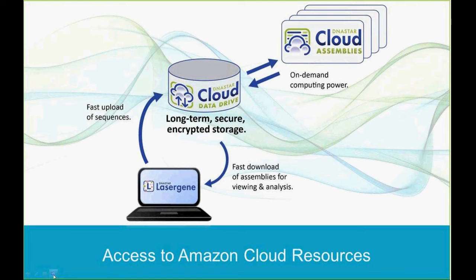One of the focuses for DNASTAR the past couple years has been accuracy. For any of these NGS workflows, whether it's ChIP-Seq or RNA-Seq or targeted resequencing, you want to be assured that the assembly algorithm is the most accurate that you can possibly use. We've gone to great lengths to really validate our accuracy claims, and we've got white papers on our website.